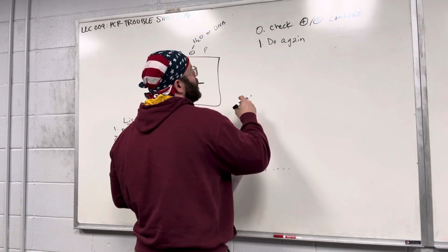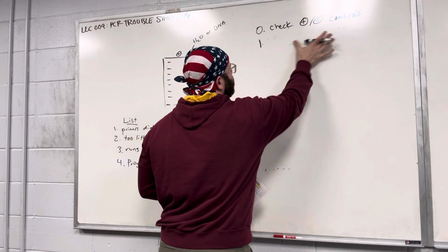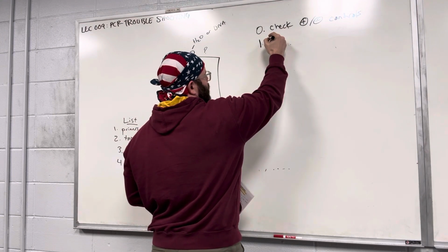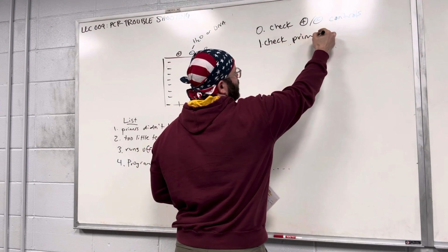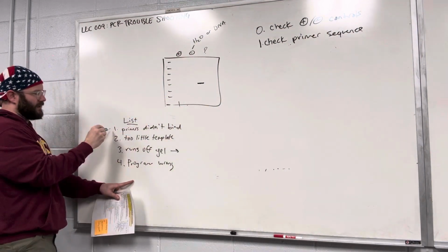Okay, so I would first check for positive and minus controls in your experiment. Then I would check the primers. Check the primer sequence. That would cover this.